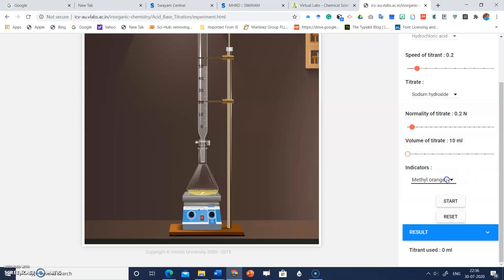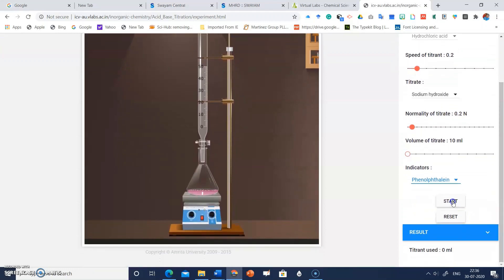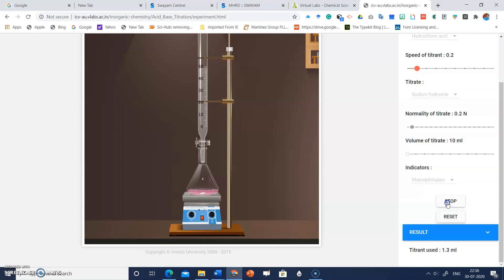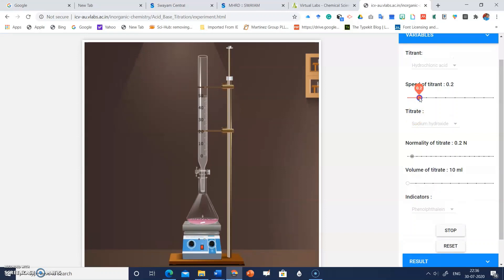You can also choose an indicator. For a strong acid and strong base, I'll go with phenolphthalein indicator. Click on phenolphthalein, then click 'Start.' When you click start, the titrate will start falling into the titration flask. When the pink color disappears, stop the experiment. You can also increase the speed of the titrant.